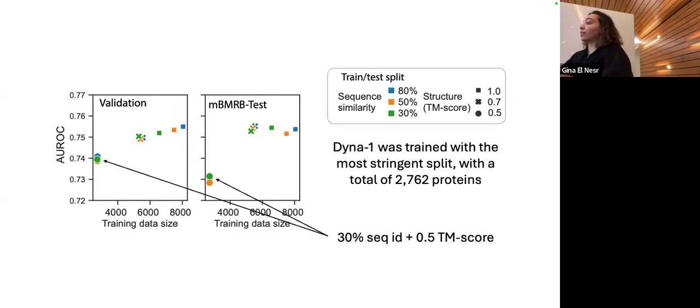So a lot of the exchange that gets recognized might be the binding pocket, but also the residues that are anchoring and allowing for the entire domain movement. It's conceptually a fun rabbit hole to dive down, but sounds quite difficult in terms of identifying directly identical pockets. And if you go down the route of how similar these two loops are, you might not end up with any data. It's a fun, interesting thought experiment.